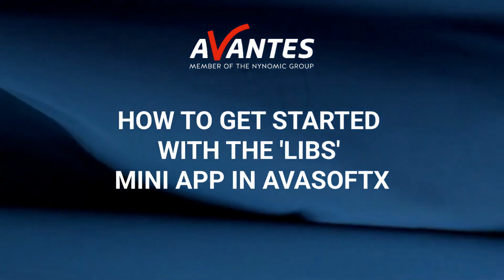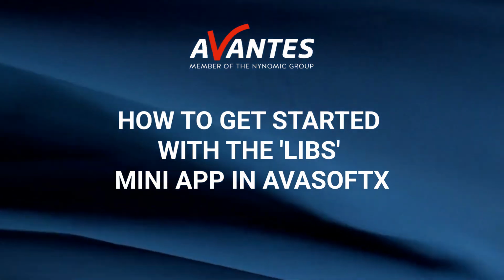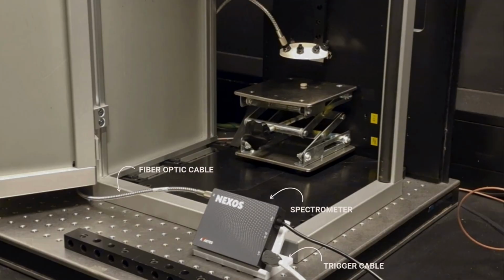In this video, you'll learn how to connect your spectroscopy setup with the LIBS mini app in AvaSoftX. You'll need a spectrometer, a laser, a fiber optic cable, and a trigger cable to connect to the trigger box. Make sure that you take into account all safety requirements needed for working with a laser.